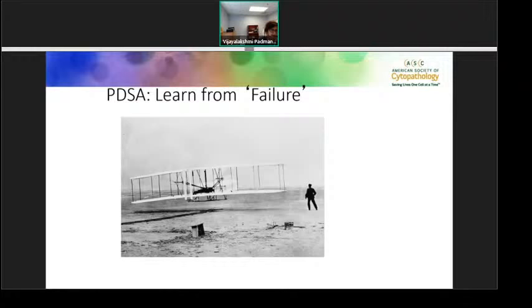But there is more and more of that. We do that even here sometimes. Some of our cases do get processed as a cell block because you really want to keep it together, and you don't want the tissue floating off, frankly. They're just such tiny little bits of tissue. Yeah, this is important, and you actually have a paper on this, recommending putting the small biopsies, skinny or core biopsies, and reporting them together with the cytology if you have it. Yeah, there's a white paper that came out a while ago recommending it. Yes. Okay, here's another question.